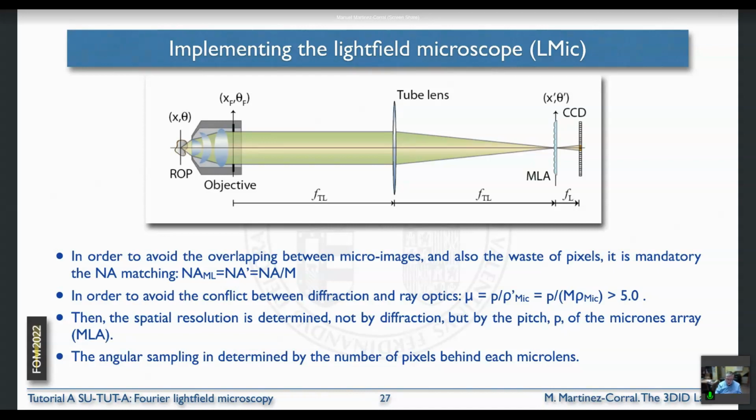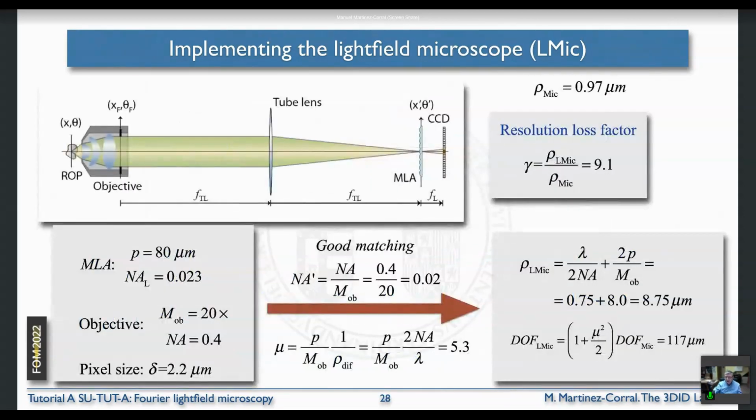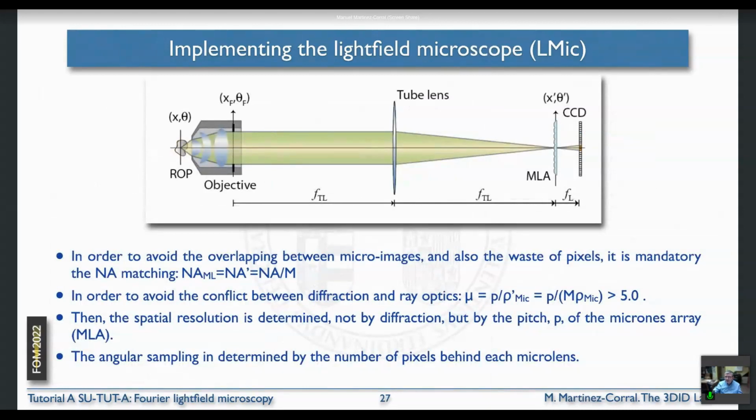Another question that is very important in Lightfield microscopy is that the Lightfield concept is based on a ray optic concept. So it is based on the fact that we assume that this pixel is collecting a ray that has a given inclination.